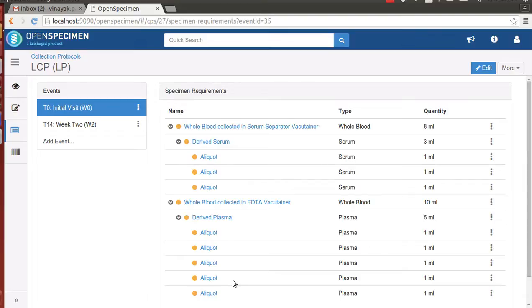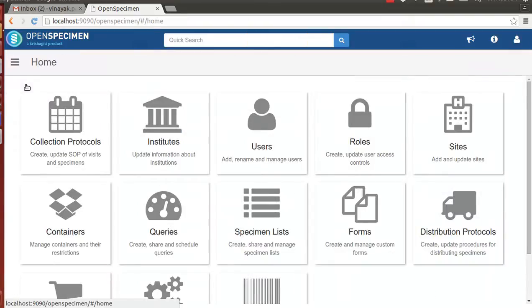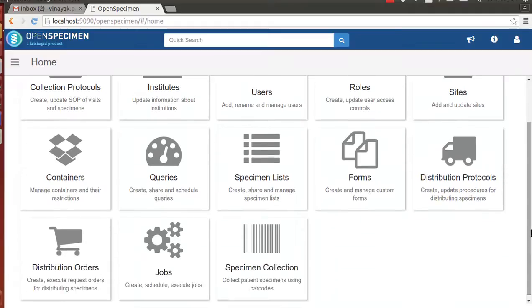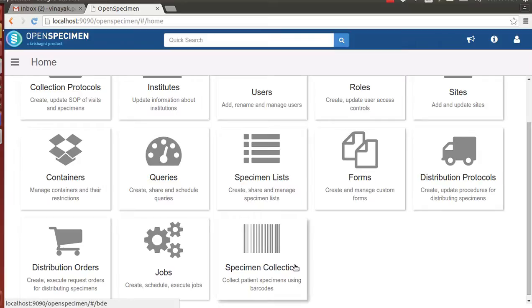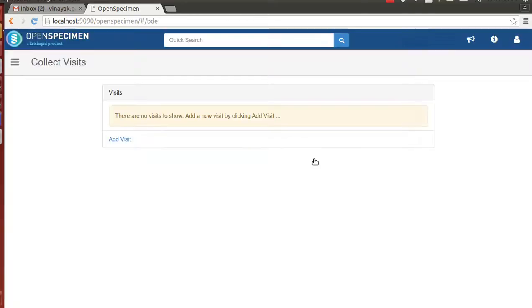With this little bit idea about the study setup, let's see the workings of the custom workflow. The custom workflow can be accessed from the home screen by clicking on specimen collection card. The initial screen that is presented to the users is Collect Visits.